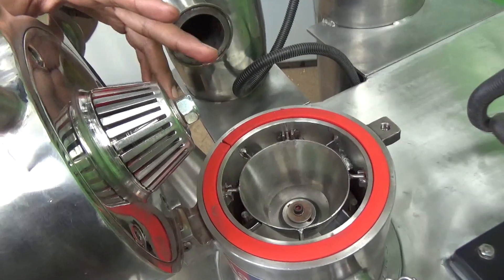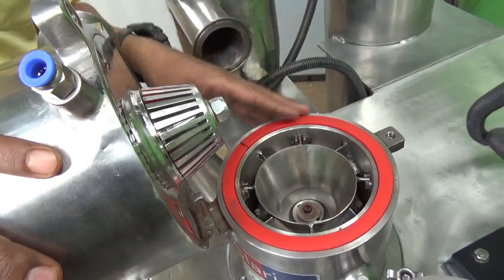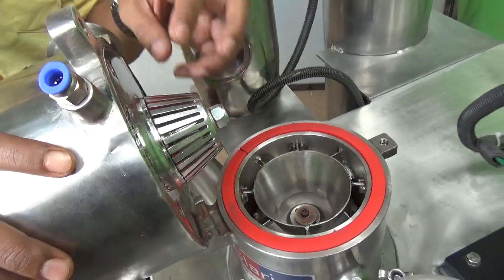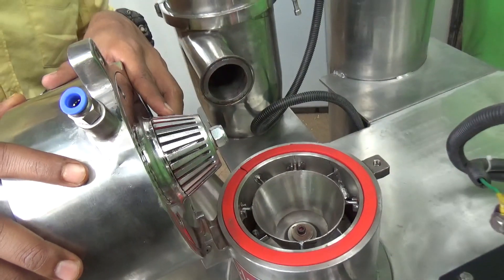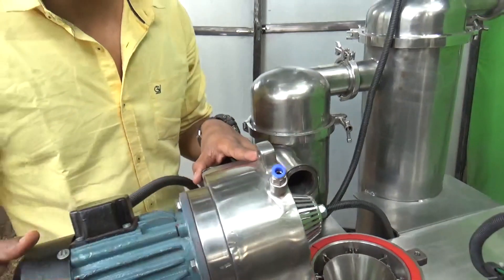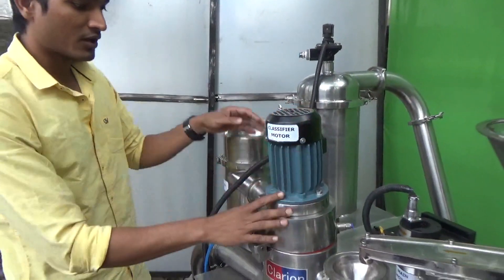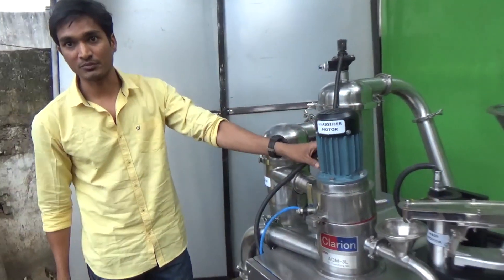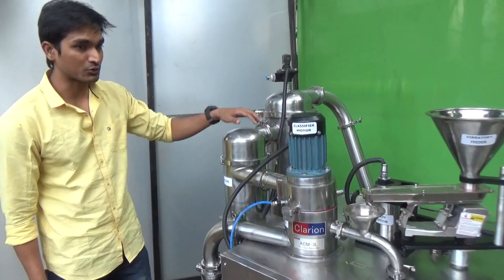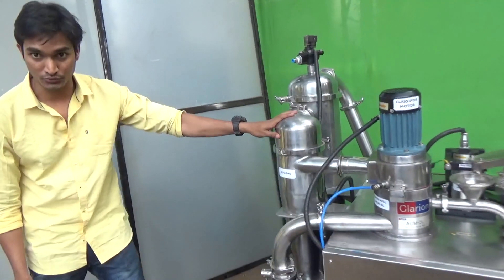Once the material is transferred to this classifier, the material is delivered to the cyclone. The classifier has an effect where any material not suitable for classification is thrown back to the grinder for further grinding. Once the desired material is obtained from the classifier, it is delivered to the cyclone, where it is collected into the collection drum.